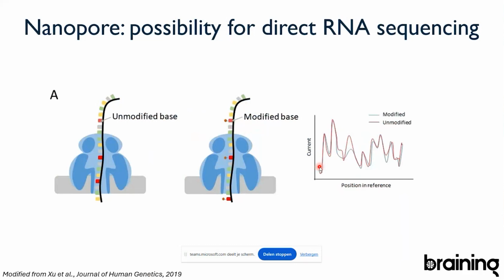And I have to say it's specifically long read sequencing with nanopores, because this does not work for PacBio. And that is because of the difference in concept by which they work. In the sense that if you use nanopore, as I said, it's a disturbance of the current at the mouth of the pore.